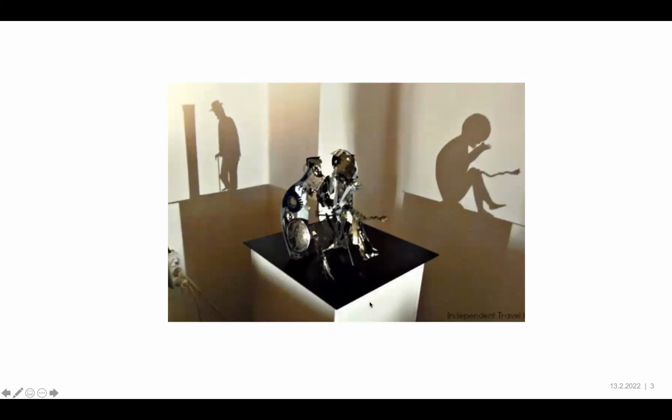In reality, these two are from exactly the same object, depending on from which direction there is a light and from which direction you are viewing. That means to understand and gain information of any object, we need 3-dimensional image or details.